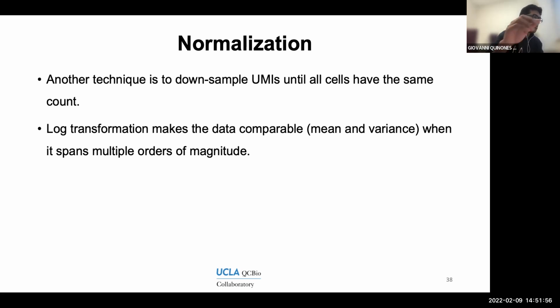And so because you have this wide range of values in gene expression, you want to transform them into the log scale so that the bigger values don't completely dominate over the smaller ones. And also whatever variance or spread there is on your distribution, you also want to convert it into the log so that it's more comparable with the more lowly expressed genes.